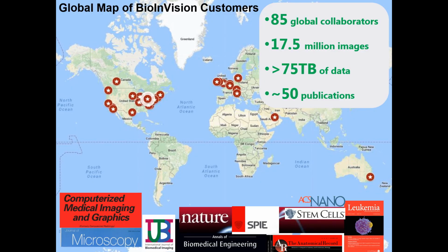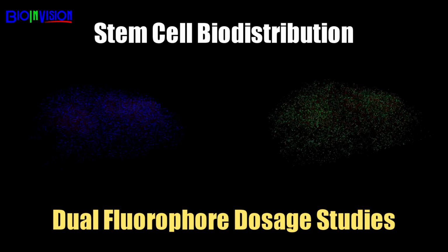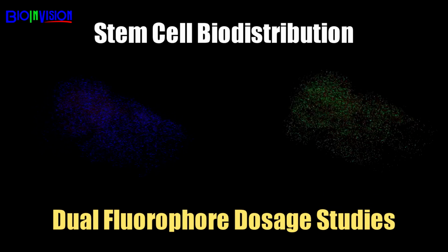Now, in the last decade, CryoViz technology has been widely and successfully used on a global basis. And the volume and variety of areas employed should give you assurance that our imaging service, while powerful, is easy to work with and cost effective.